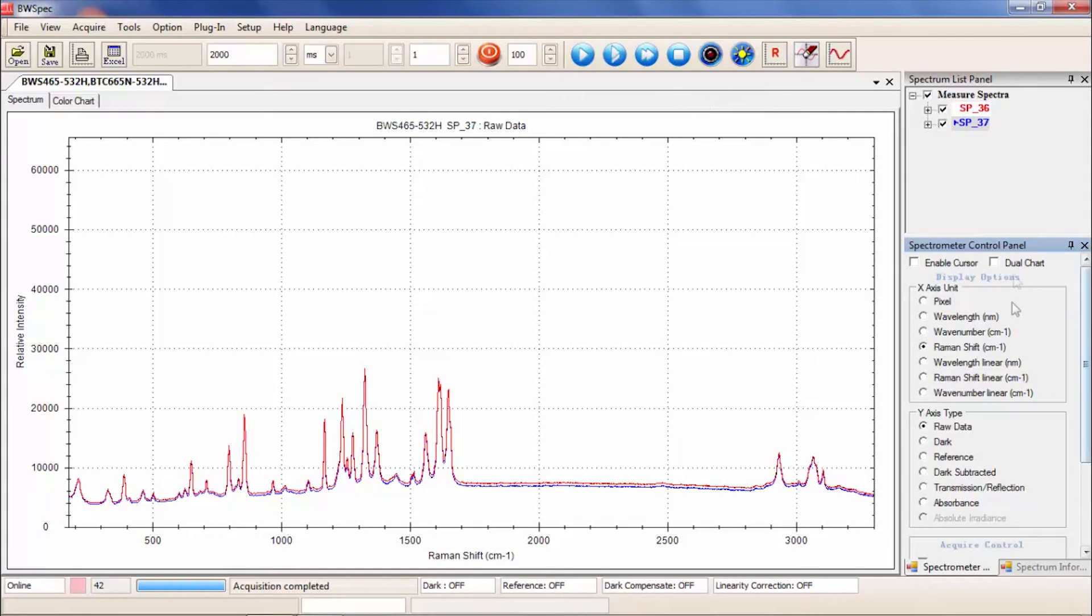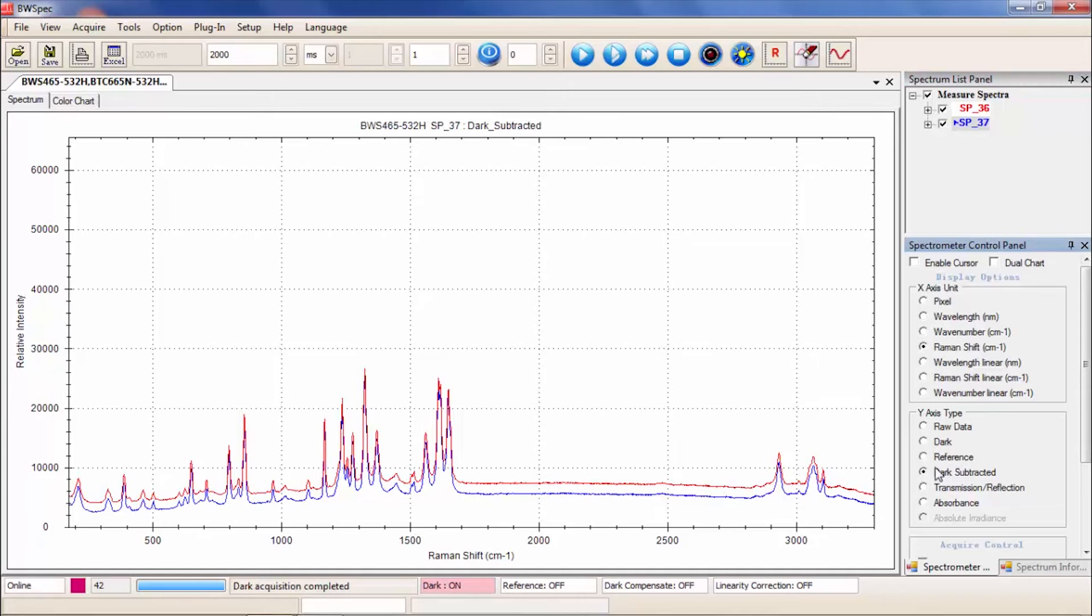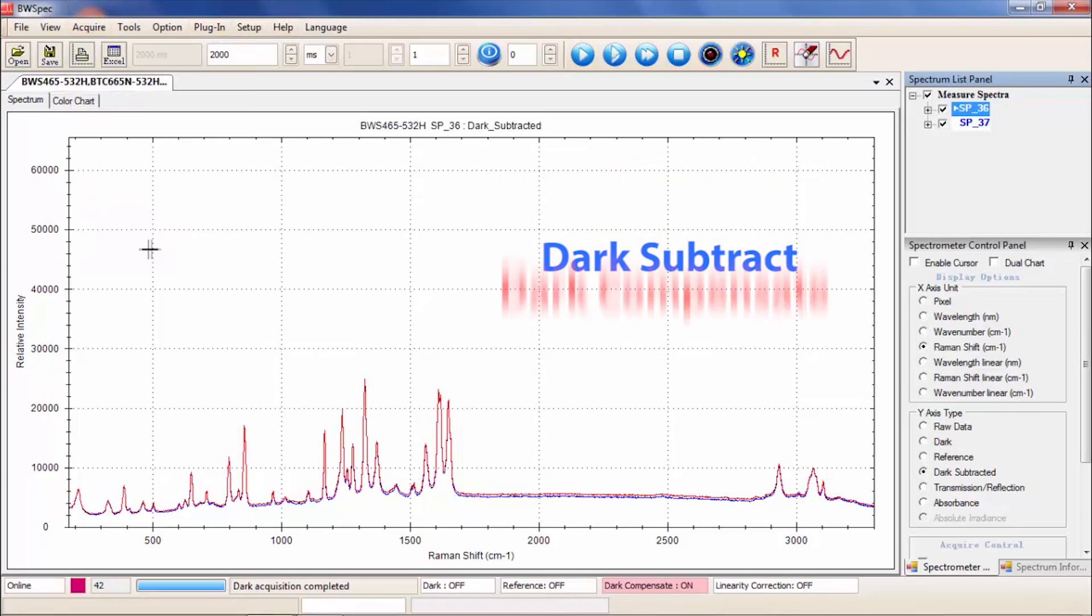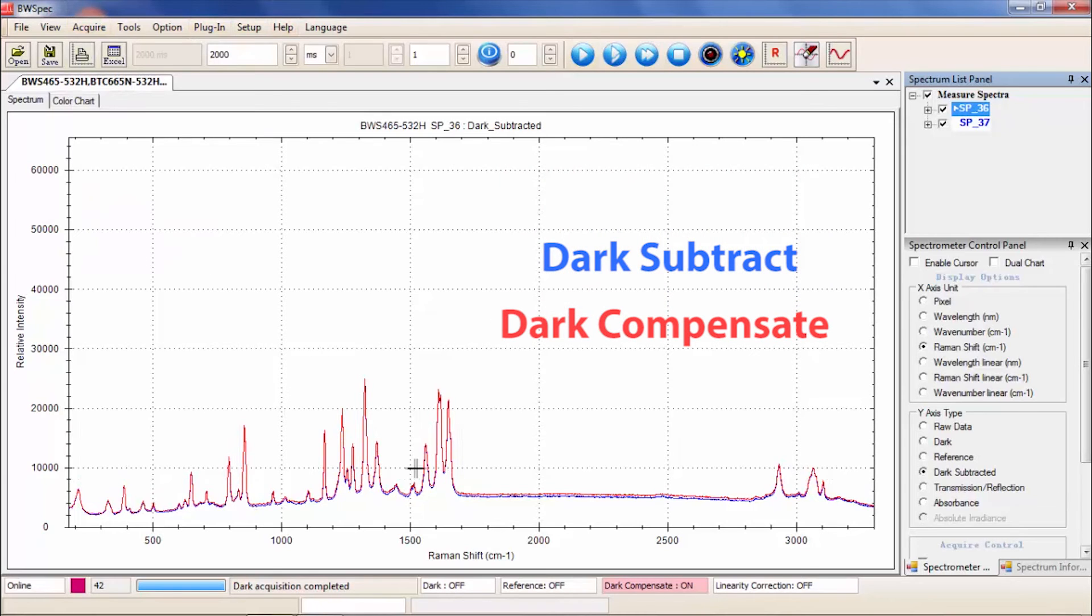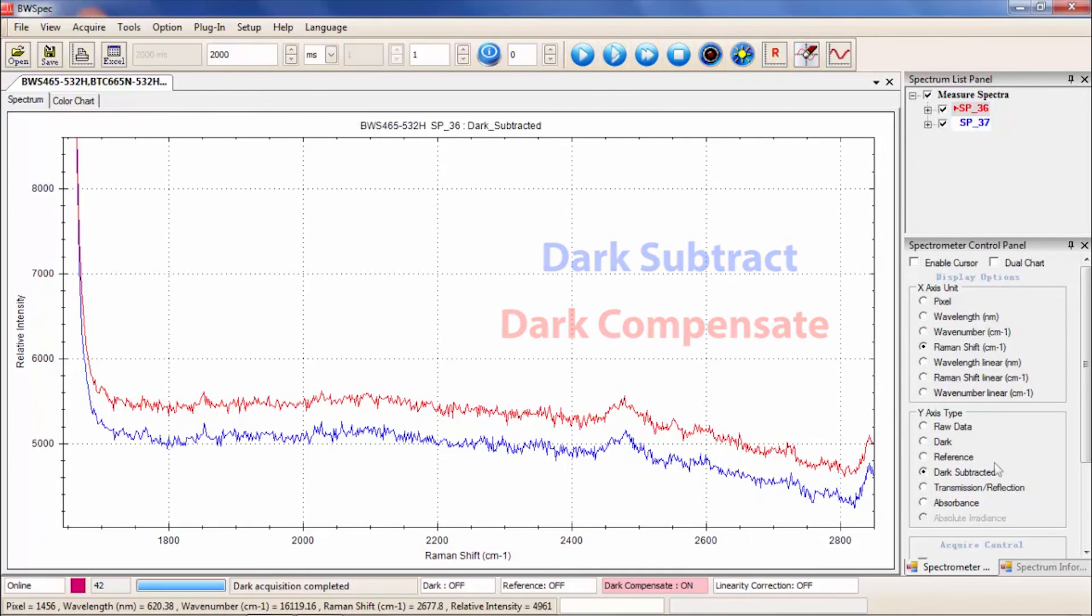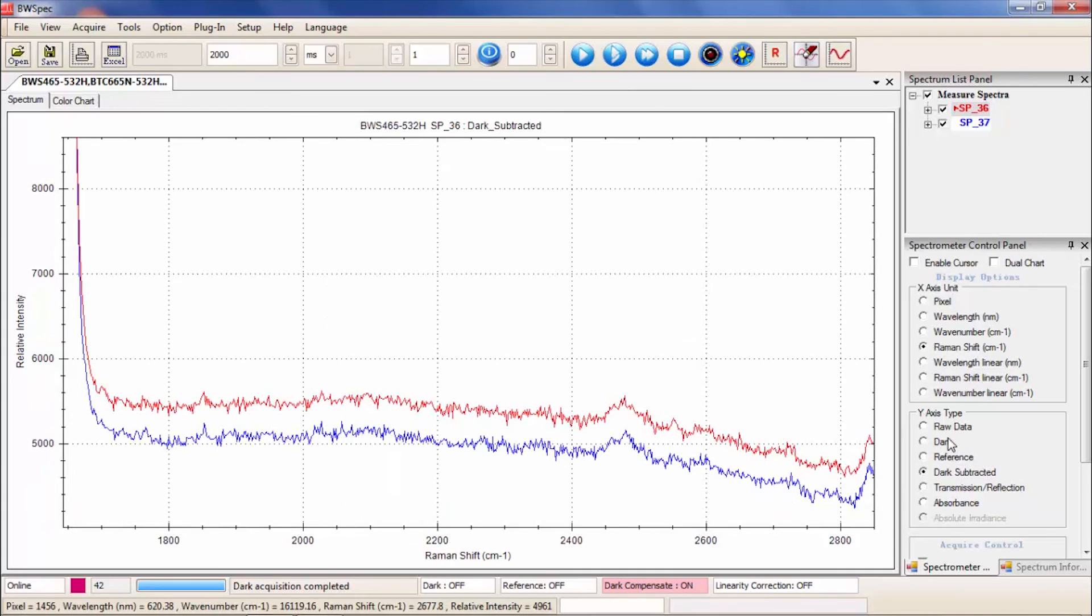For very long integration times, or when taking a dark acquisition is not possible, it may be beneficial to use Dark Compensate. This is an electronic dark reference that automatically subtracts a dark reference array from the raw data. This electronic dark reference is not as accurate as a dark scan and cannot compensate for hot pixel activity or background noise such as fluorescent lights. The dark compensate is known to be on the order of a few hundred counts higher than measured dark acquisitions.